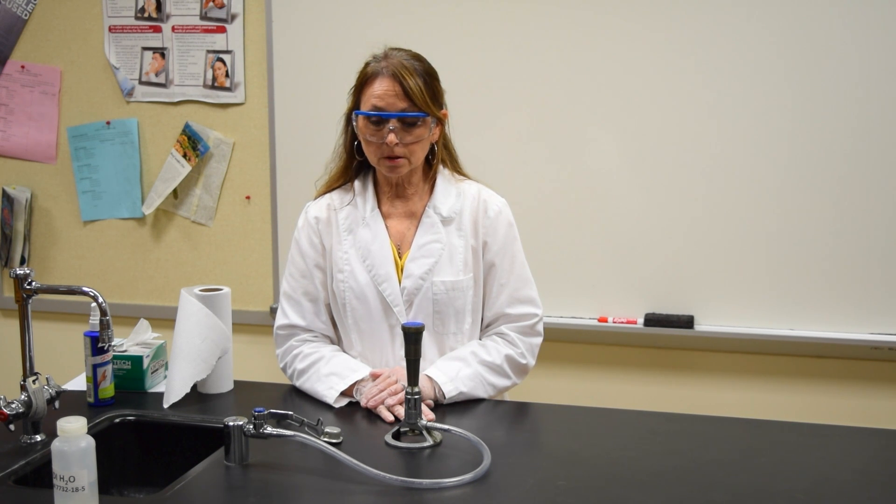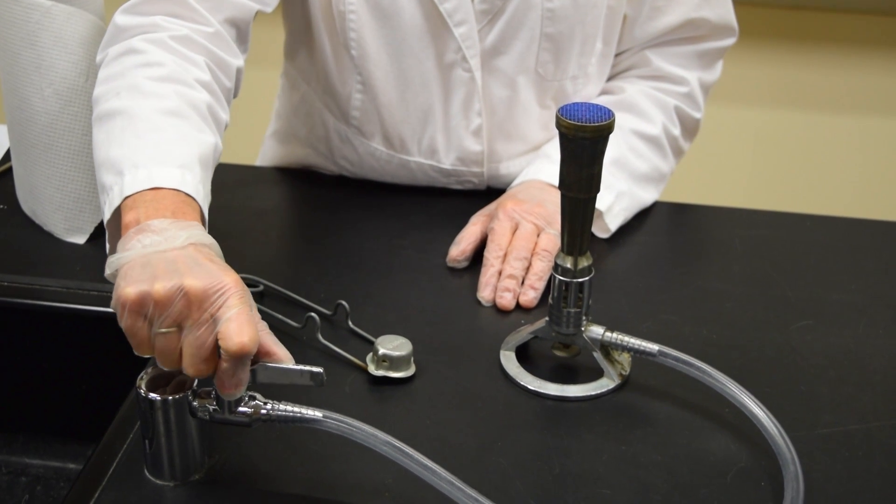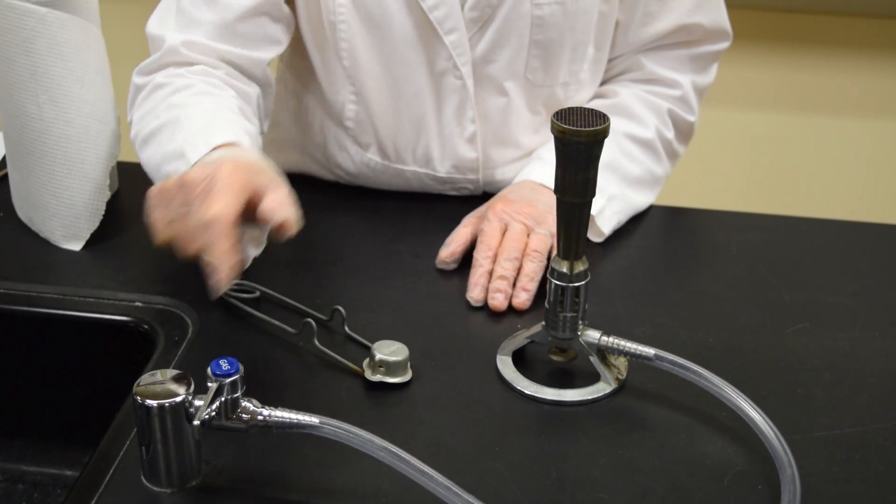To turn off your Bunsen burner, you take the handle and you move it so that it's running perpendicular to the nozzle of the gas.